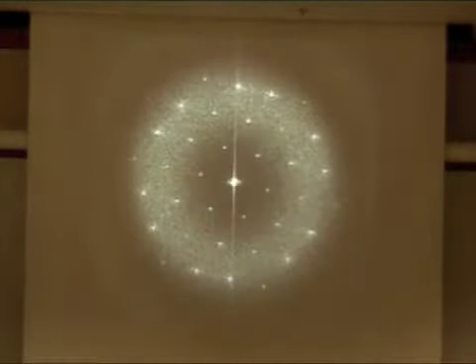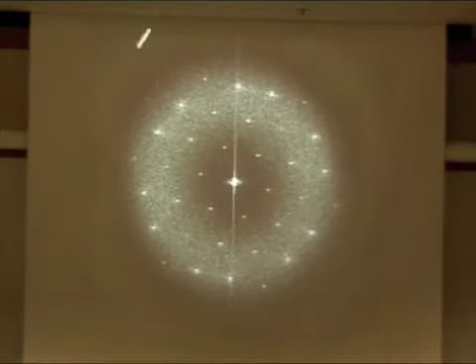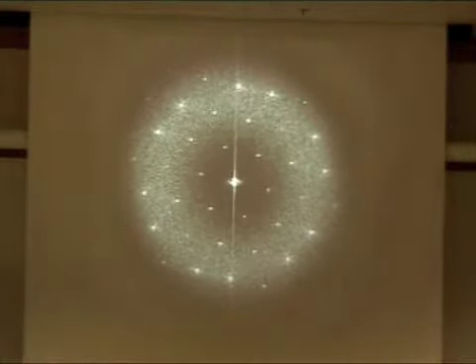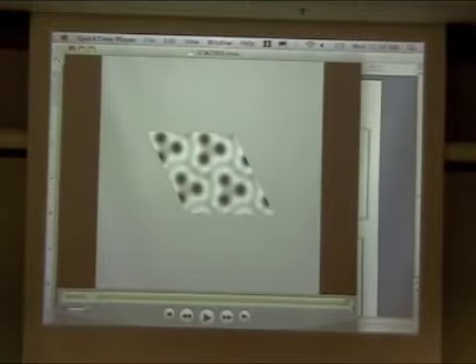And the reason for that is that when you go back to Fourier space after that unbending process has been done, suddenly the spots at low resolution are far, far better resolved. And I don't know if you can see this with the lights, but the spots at higher resolution, which simply weren't there before, are now showing up. Are those noise or signal? Well, that's debatable for later, but the point is that you see a much clearer lattice. And more spots means more pixels, more information in the final image. And with that, you can very carefully extract each of these individual amplitudes and phases, push them together, and come up with a final coherent image that actually looks something hopefully vaguely like your original protein.